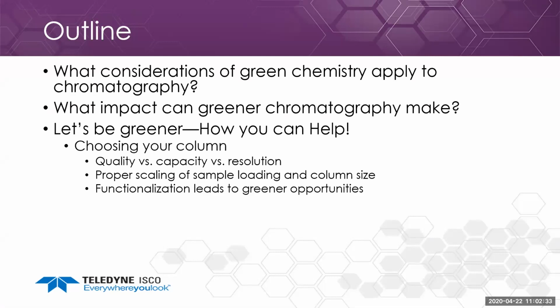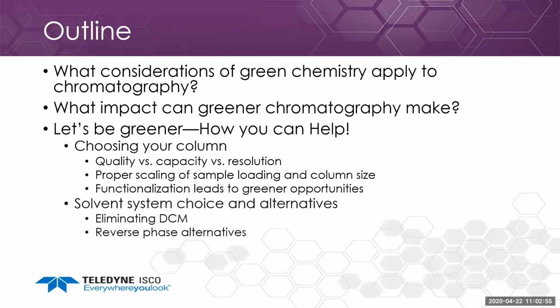And specifically, we're going to focus on choosing your column, how the quality of your media dictates your capacity and your resolution, how that impacts your green impact, and the importance of proper scaling for sample loading and column size. Changing your functionalization or media type can lead to different greener opportunities. We're also going to discuss some solvent system choices and alternatives to those.